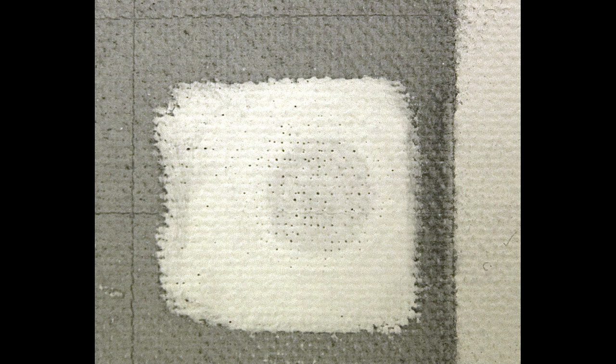In the fourth image, we see the problem. After the area is surface cleaned, we find that the drop of water has swollen the acrylic paint surface, causing the soiling to be absorbed into the swollen paint.